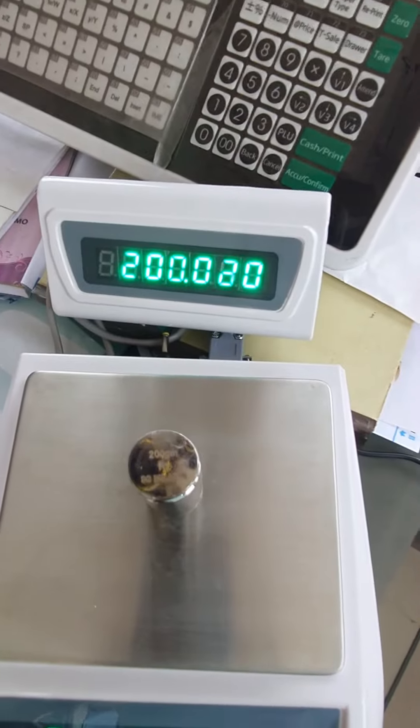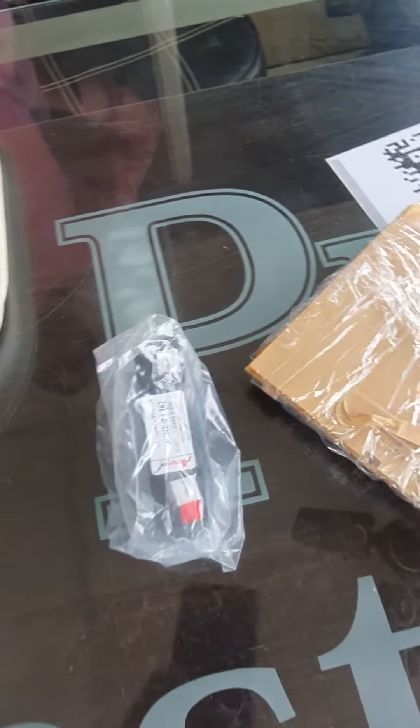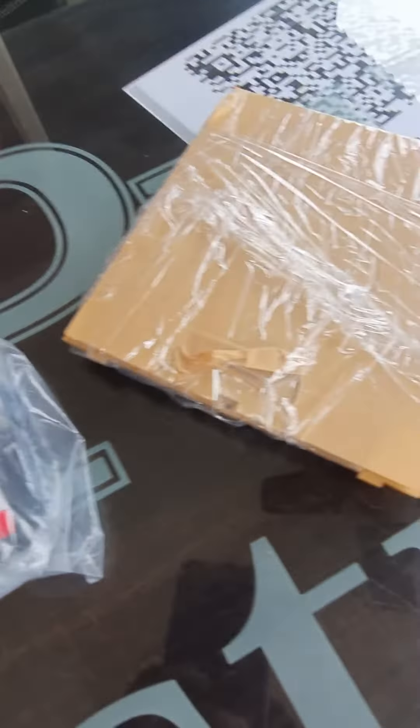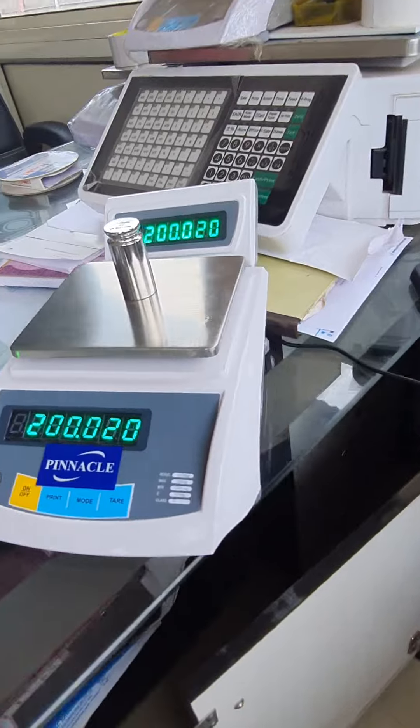We can provide an extra display, KB net, and battery. You can better see the result and the machine.